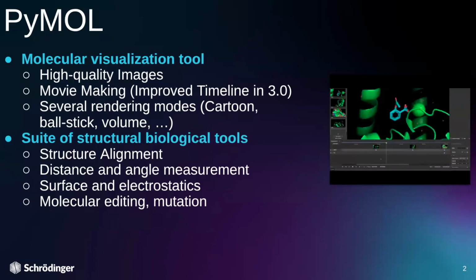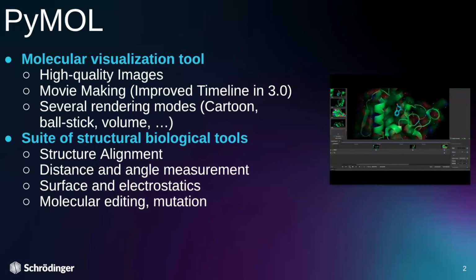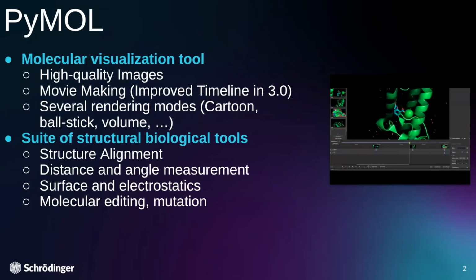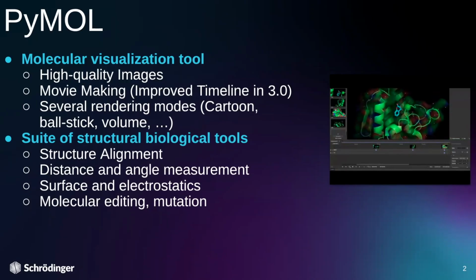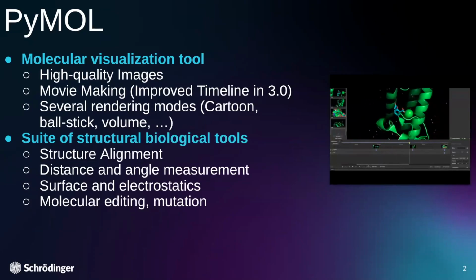We have keyframes that you can put into tracks to determine, well, I want my pose at this second, I want the camera to be here at this time point, or I want the scene that I generated earlier to be activated at this position. So it gives you a lot of control.